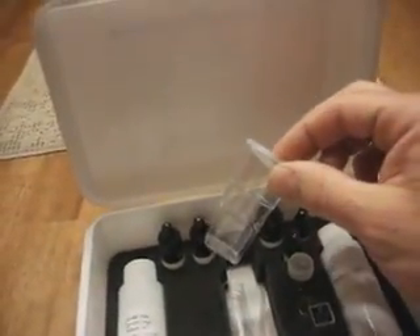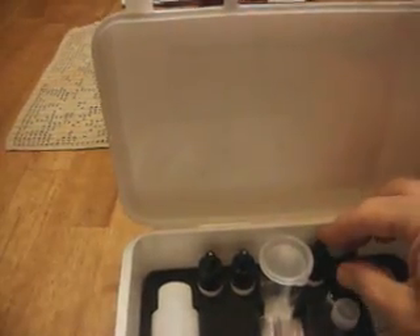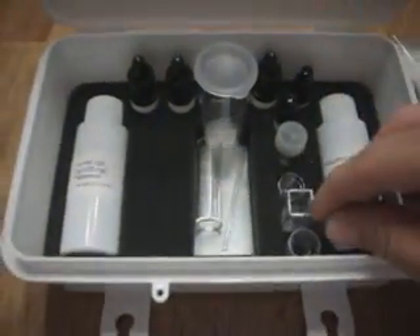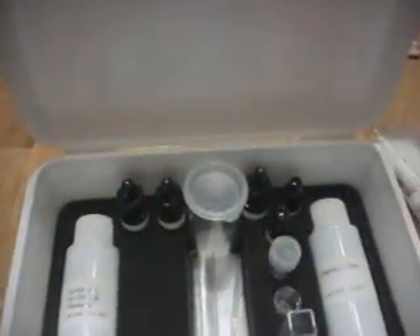A test vial. More of your magnesium solutions part one and two — these are for the carbonate and the alkalinity. It comes with several little vials and little sticks for pushing your filters down in there. I'm not going to ramble on about it too much. It seems like a pretty straightforward deal.